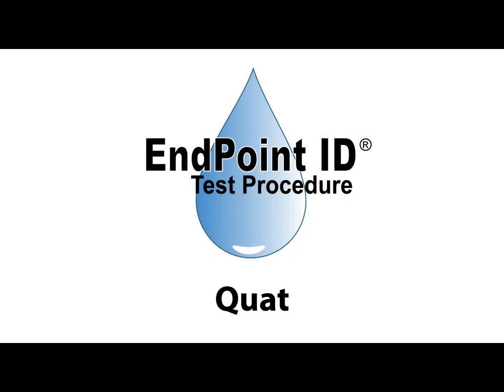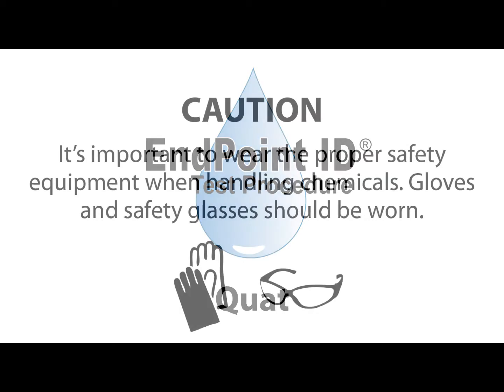This is a demonstration of a Quat series drop count test kit using endpoint ID procedures. Please refer to the appropriate endpoint ID plus instruction sheet while watching this training video.